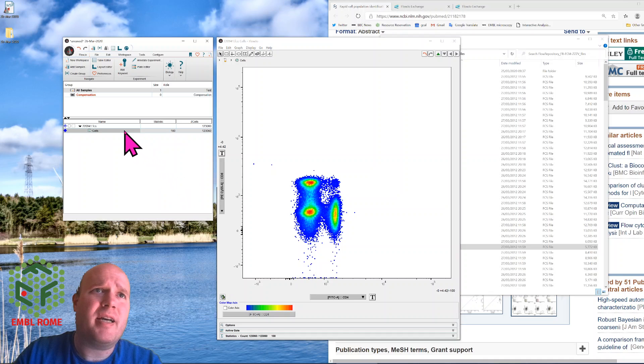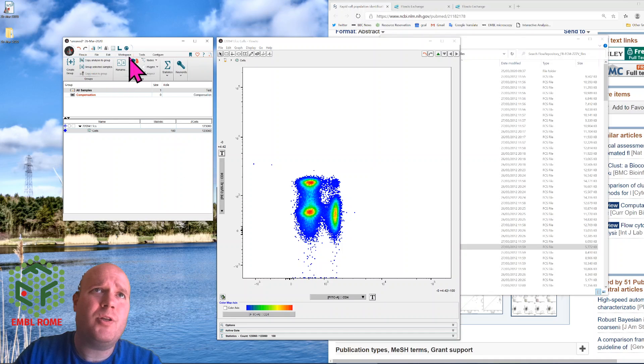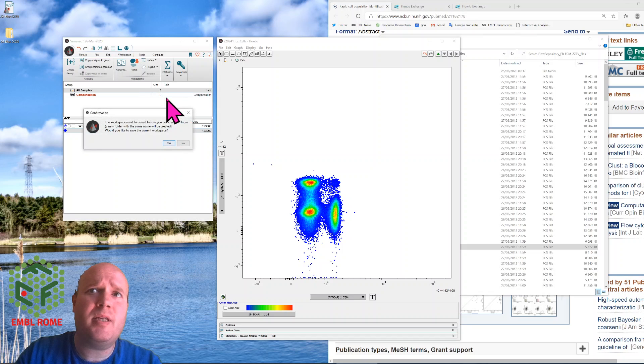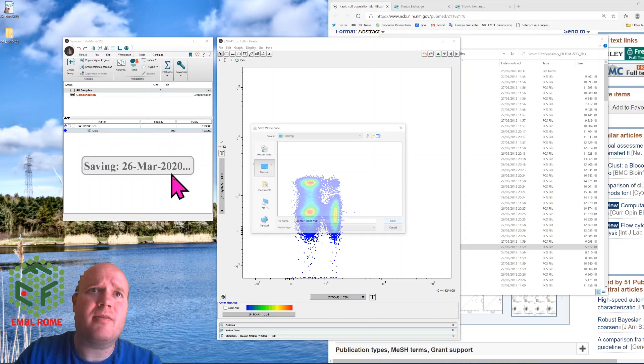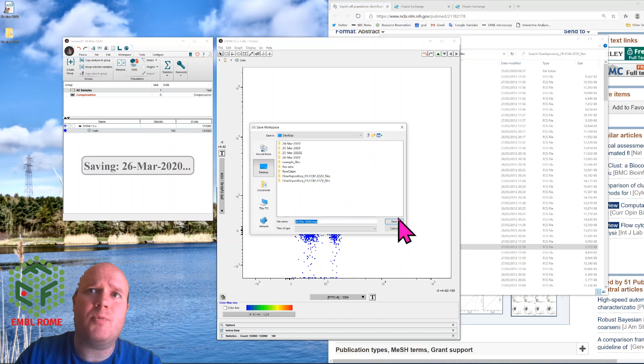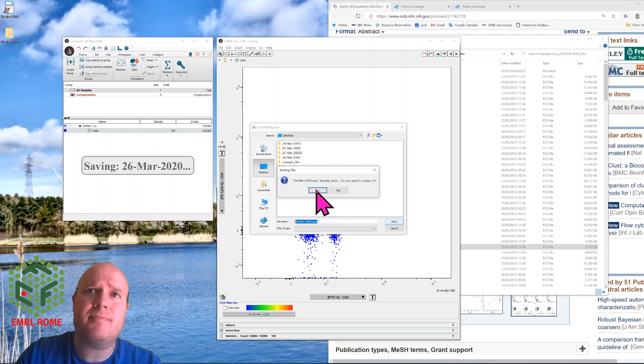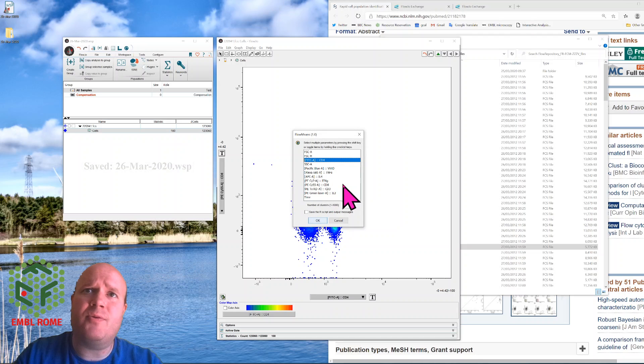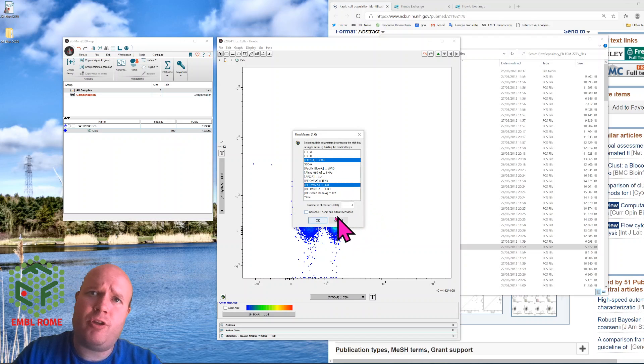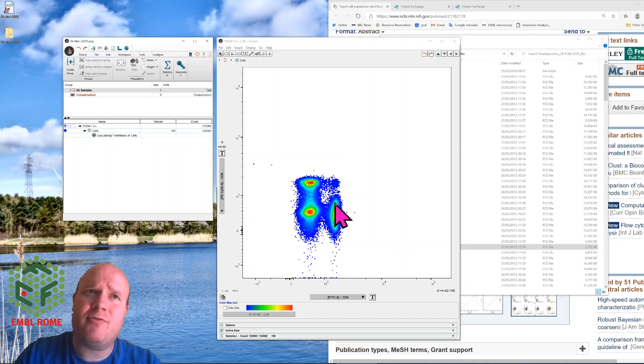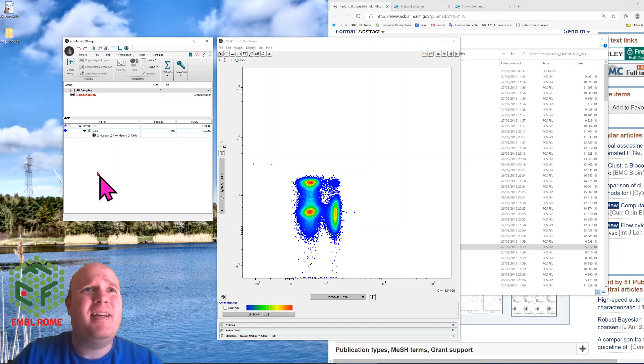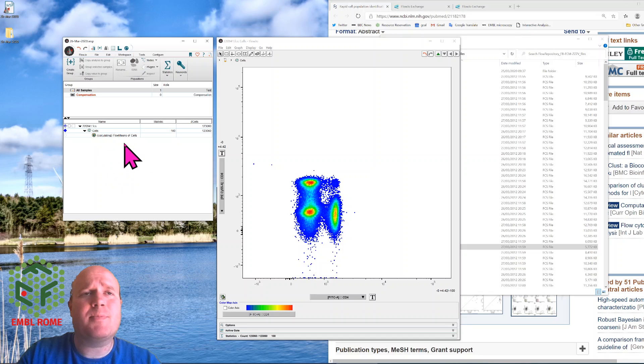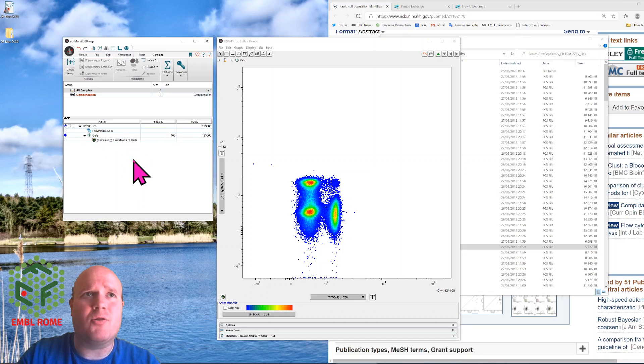So if I highlight my cell gate, workspace, plugins, FlowMeans, it wants me to save the workspace first, so I will save the workspace. Choose my CD4 and CD8. The pop3 cluster sounds about right, I can see three big clusters. And what it does, it then loads into R, does the clustering, and exports the populations back, which would be called pop0, pop1, and pop2.